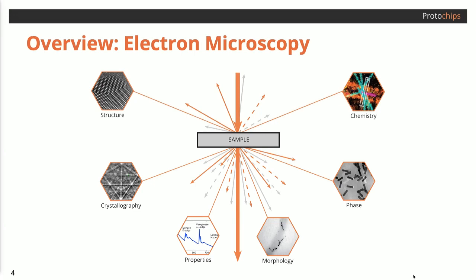For example, electron energy loss spectroscopy, or EELS, measures how much energy electrons have lost going through the sample, and this technique can be used to measure the electronic, thermal, and chemical states of the sample. Another technique, energy dispersive X-ray spectroscopy, or EDS, measures the characteristic X-rays that are produced from the electron beam to create a chemical map of the sample being imaged. Here you can see just a few types of the characterization capabilities that are accessible within the modern electron microscope.